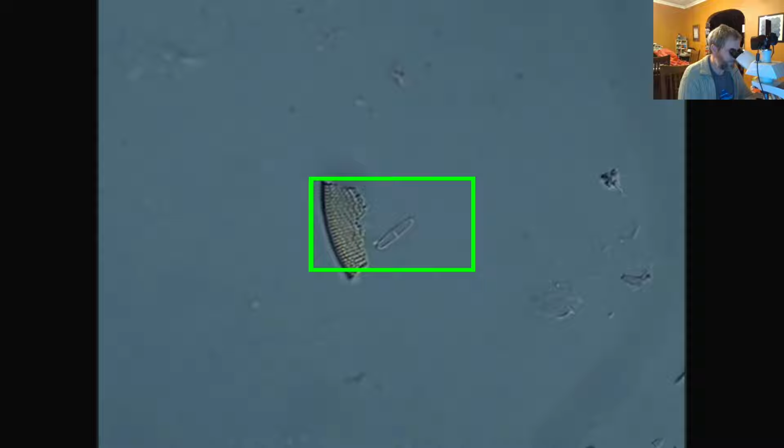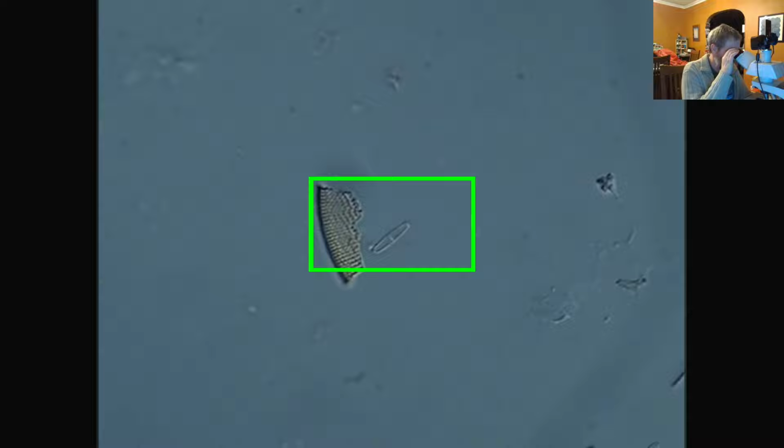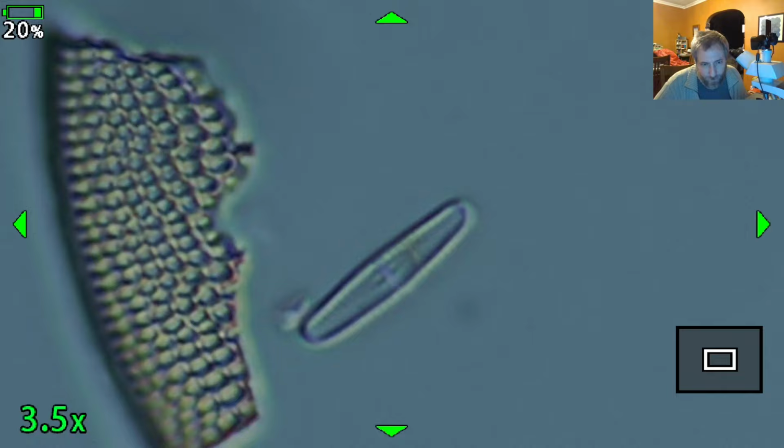So see this little tiny guy right here? A little thing right there that looks like a pill? That's actually a really tiny little diatom. It's about 10 microns long and about 2 microns wide, and it belongs to the genus Achnanthidium. It's monoraphid, so you can actually see both valves there. If I focus through it, the raphe disappears on the other valve. So there's no raphe on that one, and there's a raphe on that one, right? You can see how they're different.